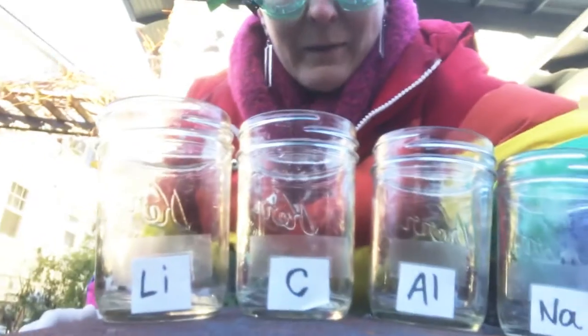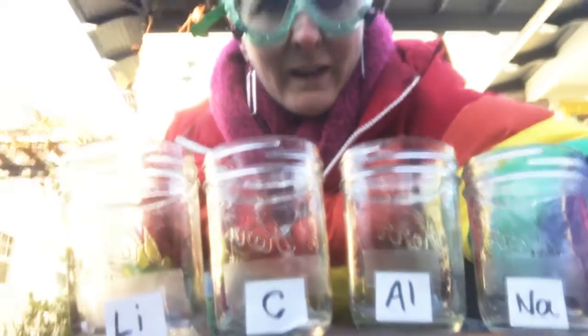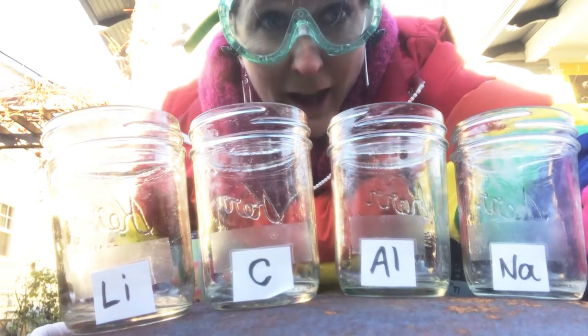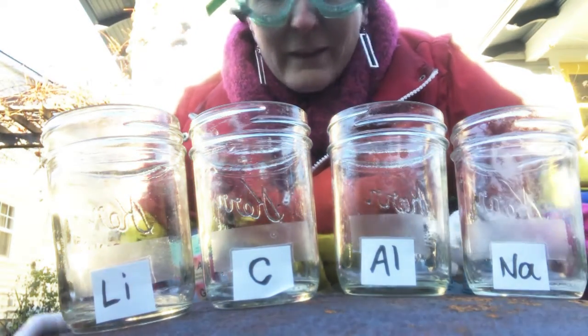All right, so now that you've had a chance to really look into the Lewis dot structure stuff, here I have a little demonstration for you in my backyard. And here we are. I'm setting you up with seeing some lithium and water, some carbon and water, some aluminum and water, and some sodium and water.